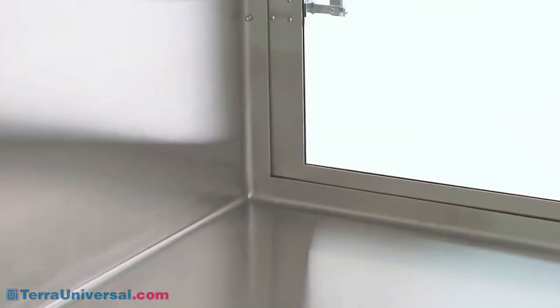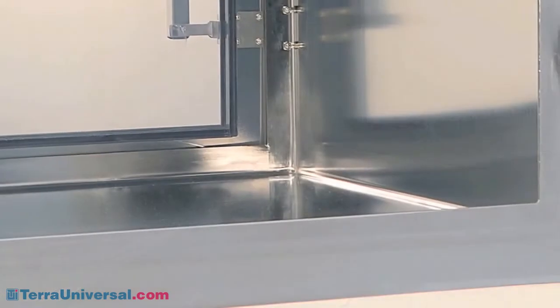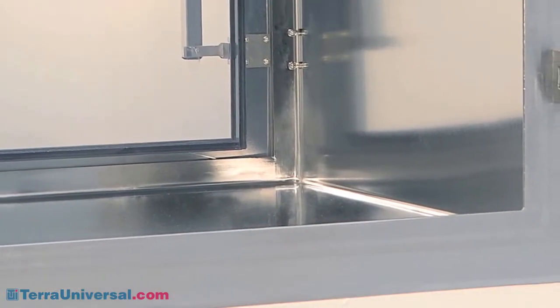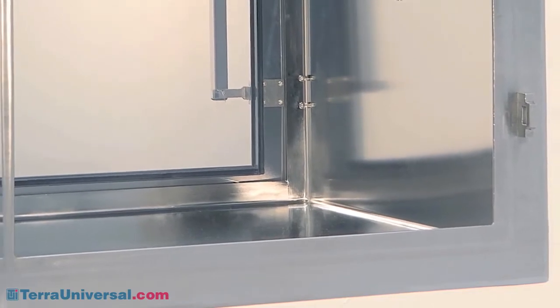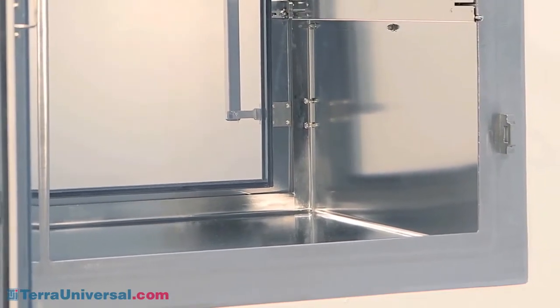Where the Clean Seam Plus chambers differ is their unique unitized design that eliminates all welded seams and internal cracks. All 12 internal corners feature seamless radius bends free of welds, grinding marks, burrs, or cracks that can collect contaminants and harbor germs.